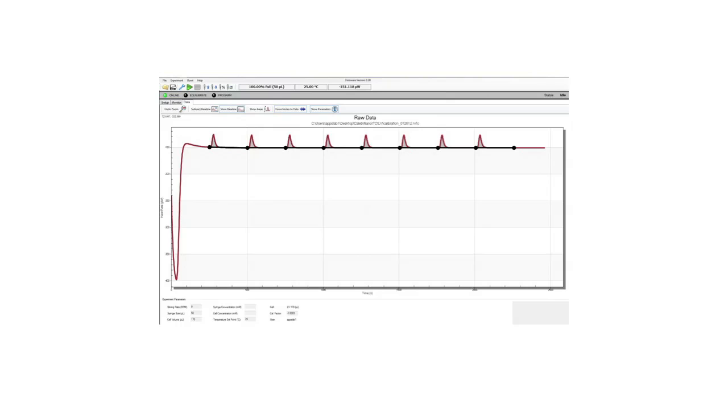After your calibration is finished, your data will look like this where you will see peaks that are integrated that are all the same size.